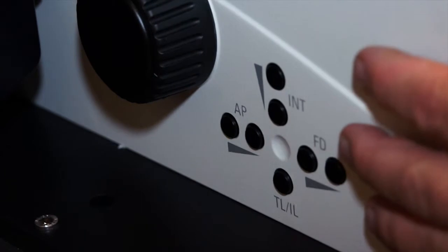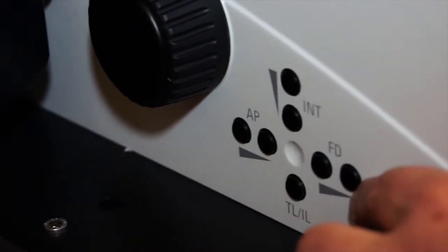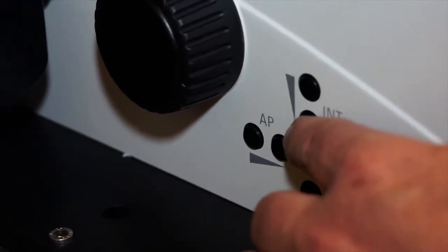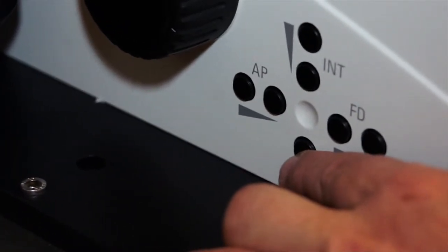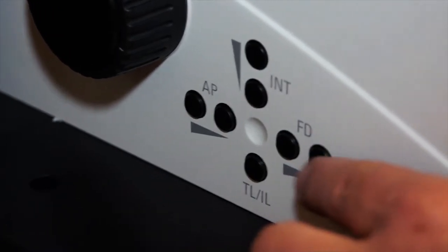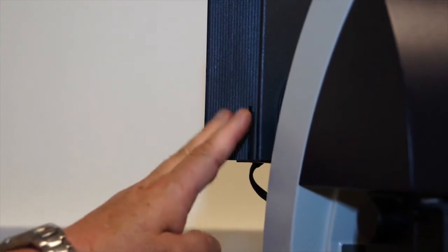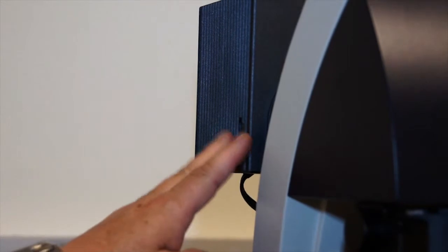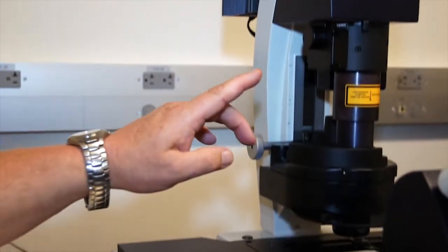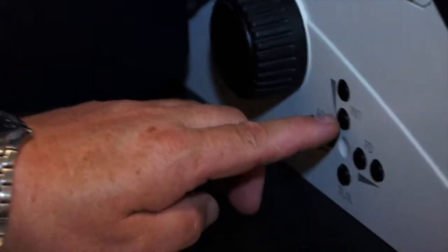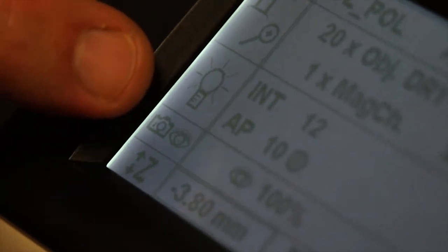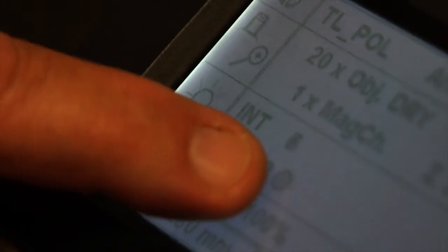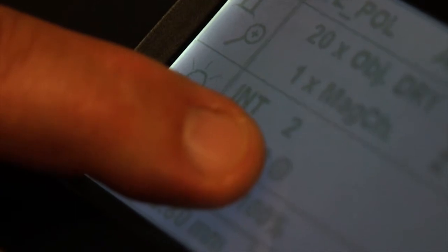Just outside the focus knob on the left side of the instrument are another important cluster of buttons. We'll discuss the intensity of the illumination, the aperture diaphragm, transmitted or reflected light illumination, and a field diaphragm used only for fluorescence. The transmitted light illuminator comes on automatically at full intensity when you turn on the power. To turn down the intensity, use the knobs labeled 'intensity' on the side of the microscope. Line three of the screen shows a bulb and its intensity level, and it's a good idea to keep the intensity low when you're not looking through the microscope to save the life of the bulb.